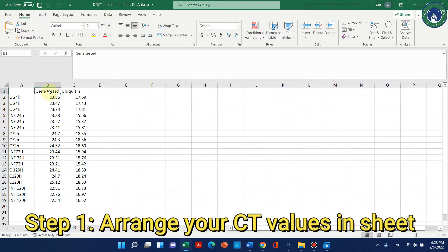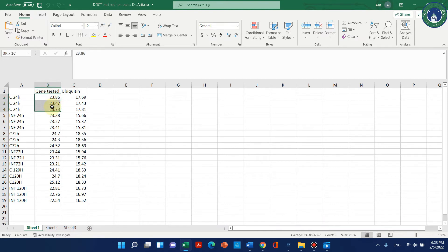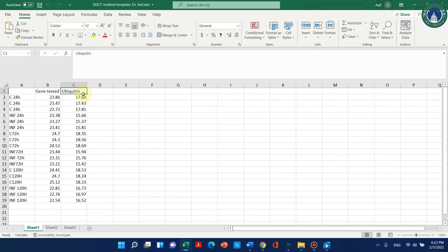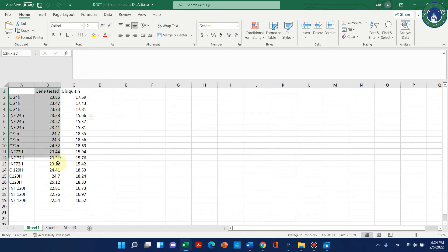This is the gene-tested value — whatever gene you want to test for relative expression, this is the CT value of that gene in the control condition. This is the CT value of the housekeeping gene — here we are using ubiquitin. You can use any housekeeping gene like ubiquitin, actin, GAPDH, or whatever you have used in your data. You just need to arrange your CT values, which you can extract from your qPCR real data.